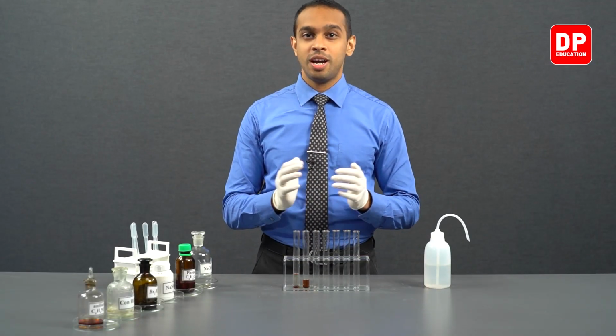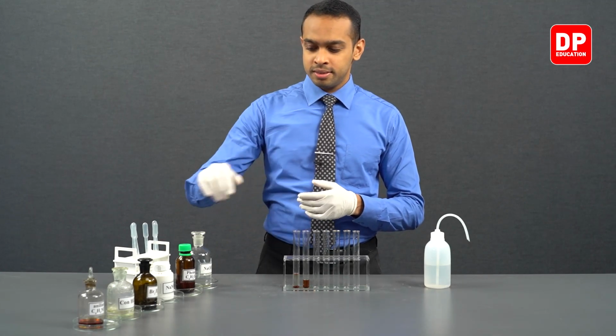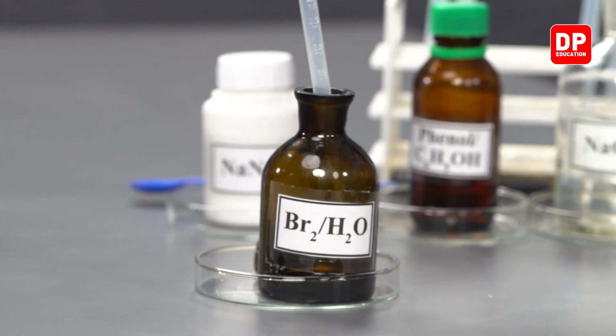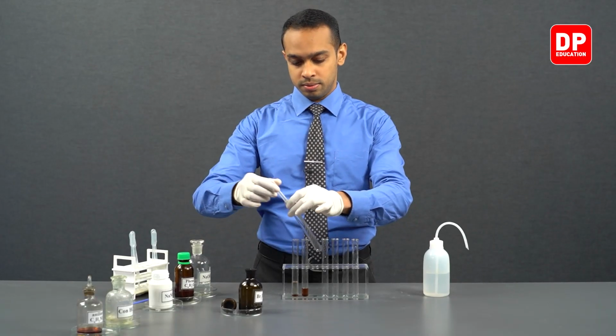Let's see how aniline reacts with bromine water. We have our bromine water here. Let's take a small amount of bromine water into a test tube.